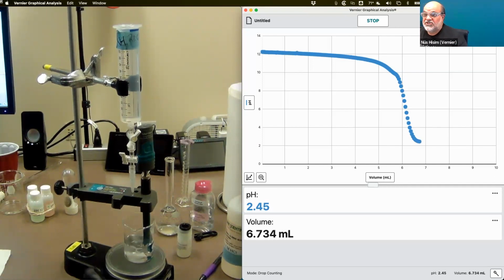And I've done this with teachers in Korea, so it's kind of cool that you could share this data in your classroom. You could share this data with Johnny at home with a broken leg, who can still get the data. This grew out of COVID, of course, because teachers wanted their kids to do experiments, but students don't exactly have stuff at home, so this is where it actually came from. But you think about the different ways you might be able to apply it.